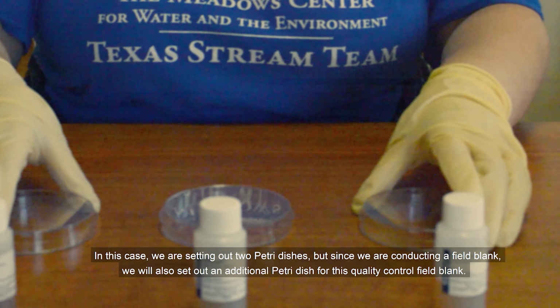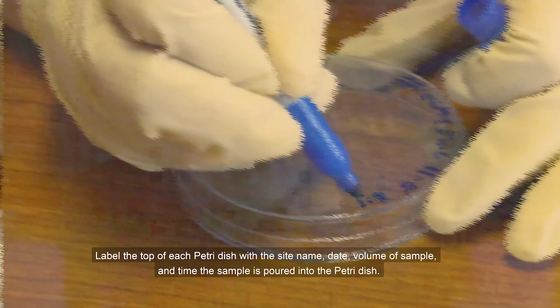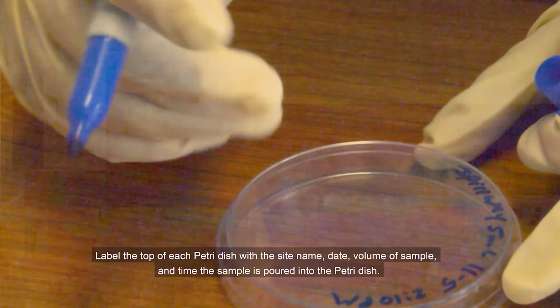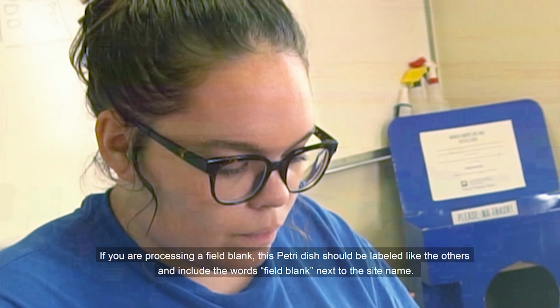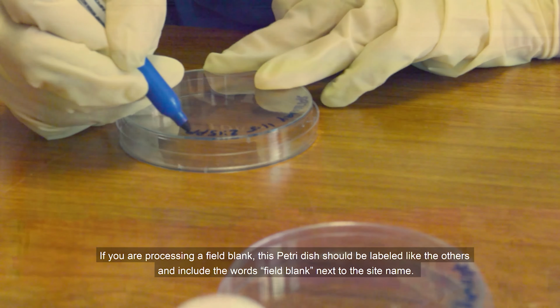But since we are conducting a field blank, we will also set out an additional petri dish for this quality control field blank. Label the top of each petri dish with the site name, date, volume of sample, and time the sample is poured into the petri dish. If you are processing a field blank, this petri dish should be labeled like the others and include the words field blank next to the site name.